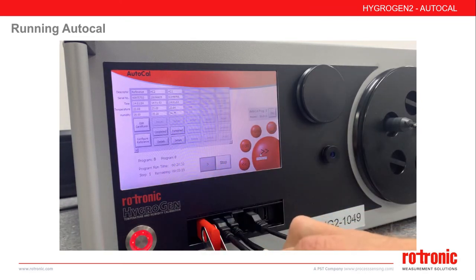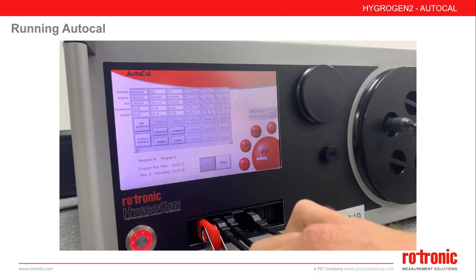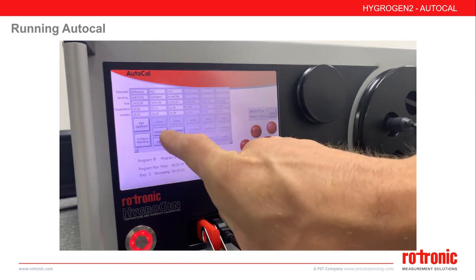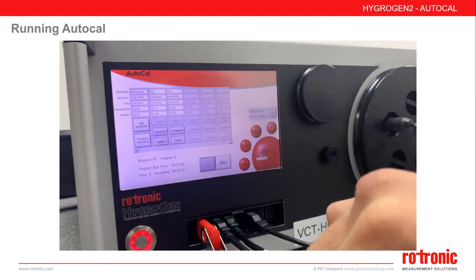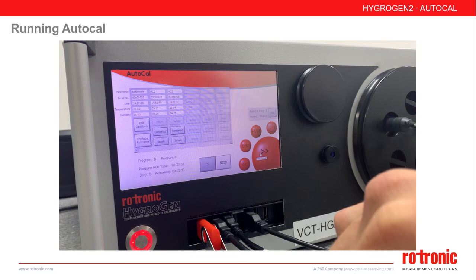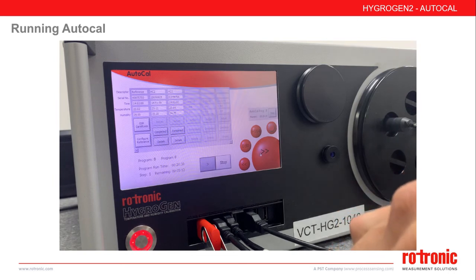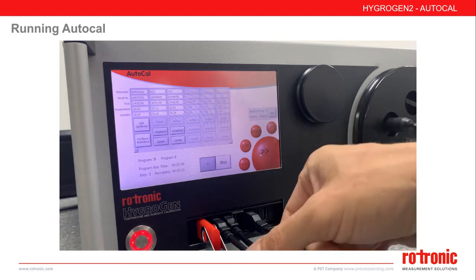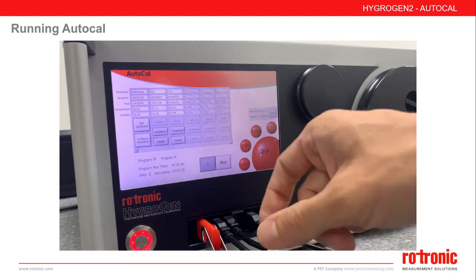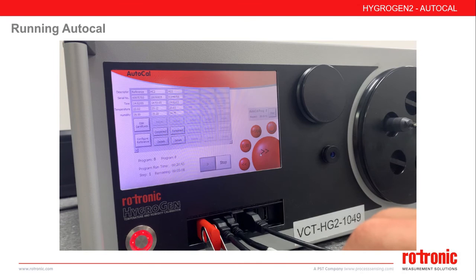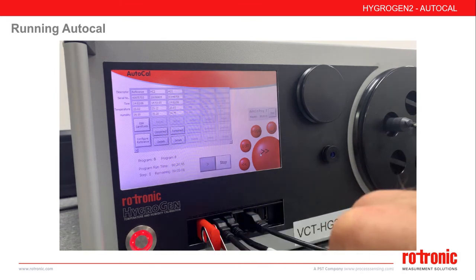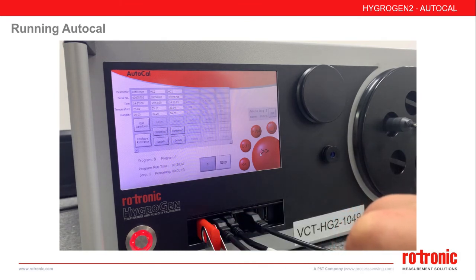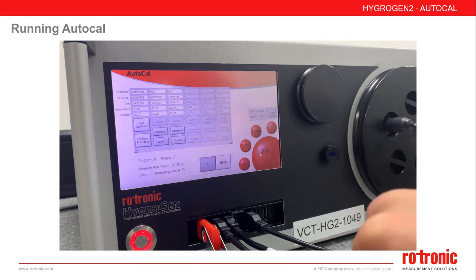Once a step is completed, AutoCal will move to the next step. Once the entire program is completed, the completed buttons will be highlighted. If for any reason there is a break in communication to a probe, the final AutoCal PDF will not be created on the USB stick — instead, only the Excel document will be saved.